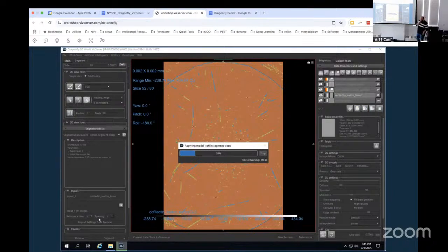Usually you iterate this a few times. Drop another section, clean it up, add more training. I mean, apparently 5 iterations is not enough. Normally, 1 iteration like this would clean up most of this junk, for sure.